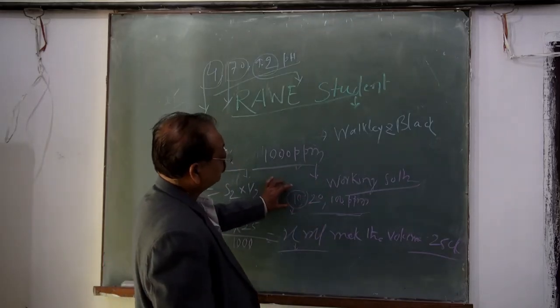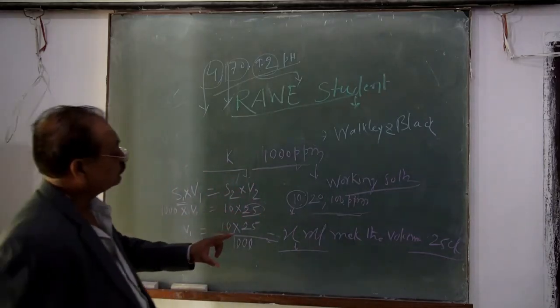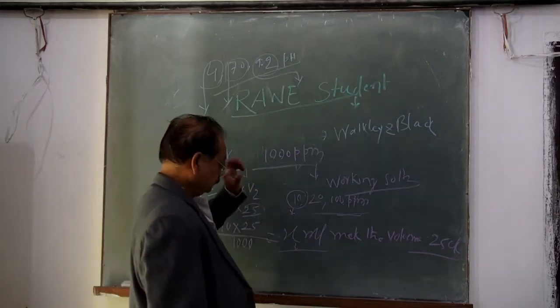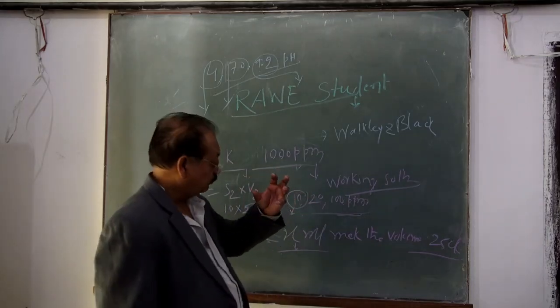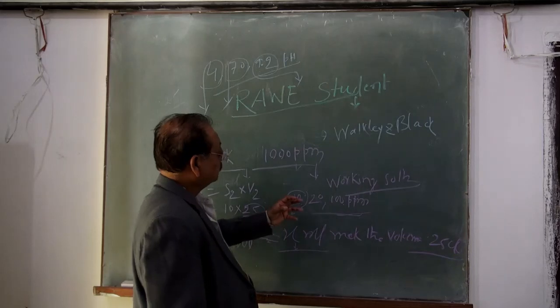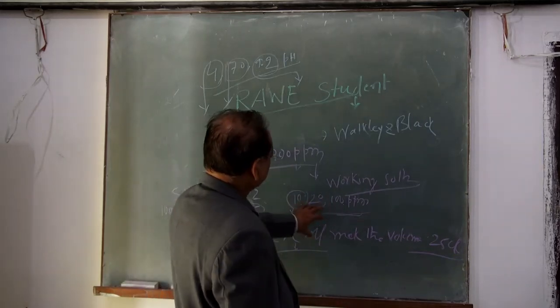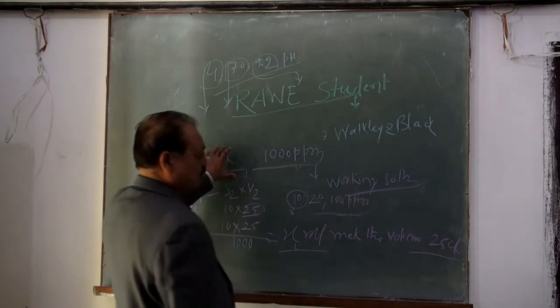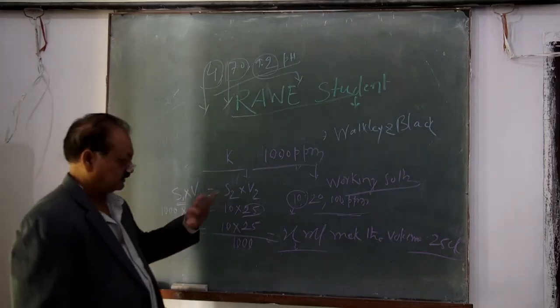Before taking the reading of your soil samples, you have to calibrate your instruments with the help of lower concentration volumes of the potassium or sulfur or phosphorus, whatever the nutrient is you are going to study.